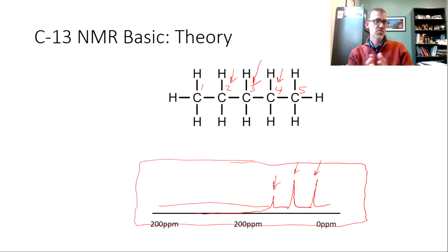And your chance to work with NMR, particularly in a freshman class, this is an unusual thing. So excited you get a chance to do it. Many of you will move on to organic chemistry next year, in which case NMR becomes a regular tool for you, because in that class you're making these organic compounds and you're going to use the NMR to analyze and see if you made what you were trying to make, things like that. So this is part of that development.